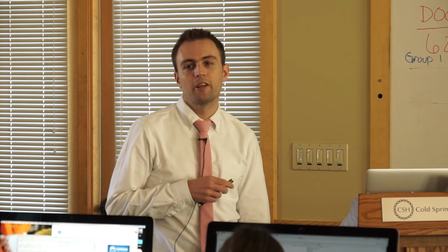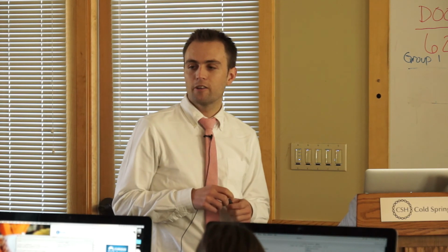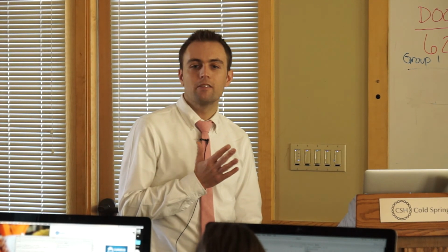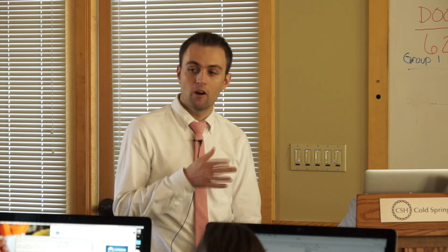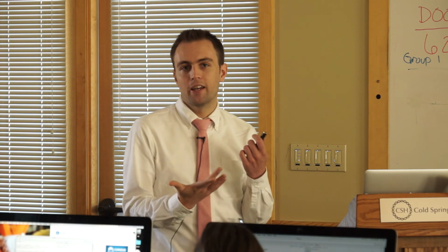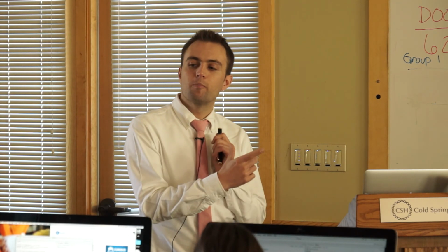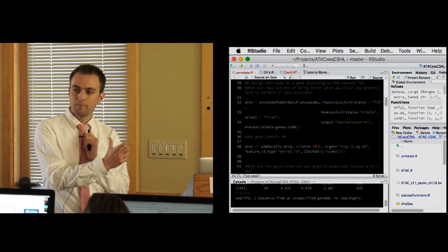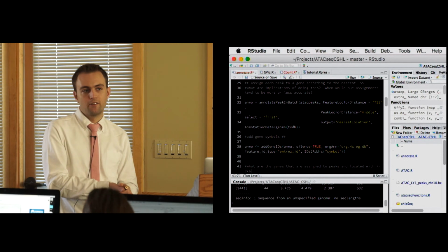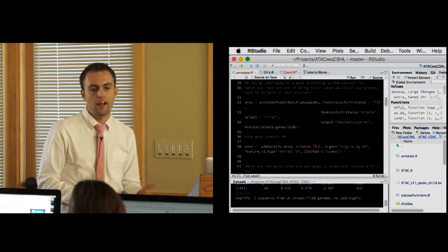There's a recent paper that assigned enhancers based on RNA-seq expression, and then they said how often it wasn't the nearest gene. I think at least 70% of the time it was correct for that cell type, but that's still not great if you're missing 30%. The other thing is that you can often have peaks that are in an intron that are regulating a nearby gene also. So that's another caveat.